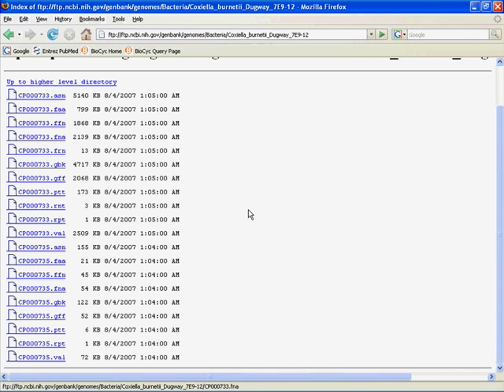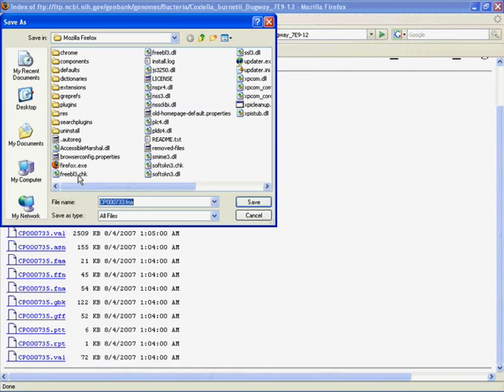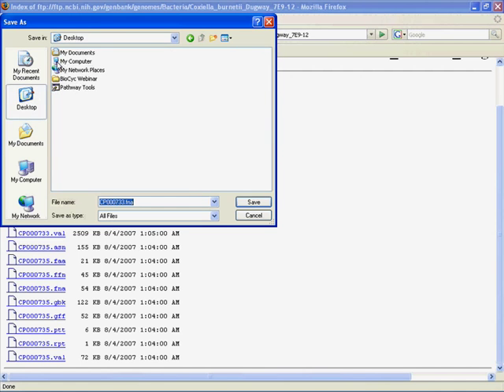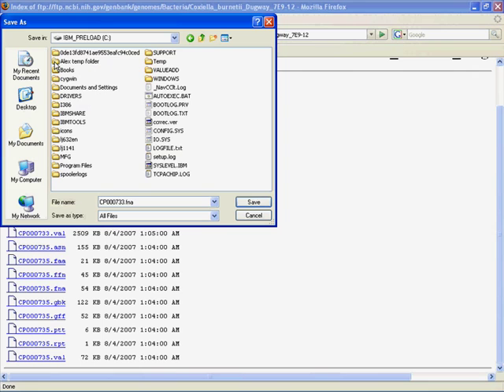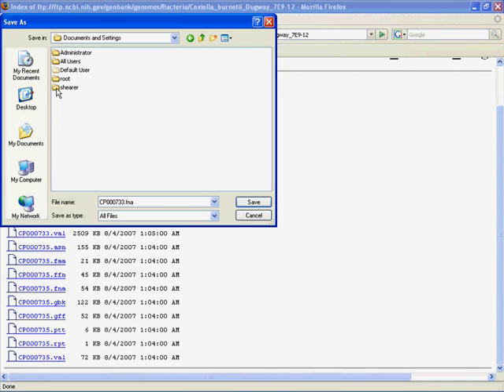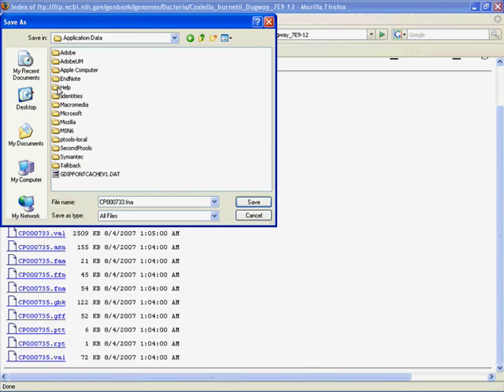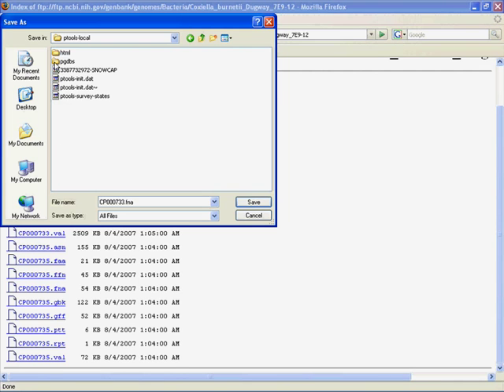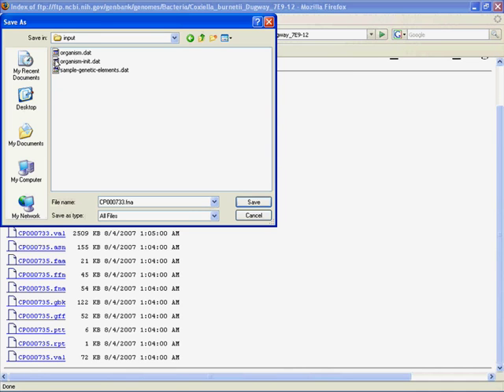Okay, so let's just start downloading and saving files. So we'll just start saving the files we need one by one into the appropriate directory. Starting with the FASTA file for the whole genome. So I'm just going to right click on that. Save link as. Okay. Back up to the desktop. For me. Computer. C. Documents and settings. Your username. And this is all on a Windows machine. This may work differently for you. You'll just want to look at where it told you it put the appropriate folder. And it told you that back on the Pathologic page that we started on. I'm going to application data. Ptools local. PGDBs for Pathway Genome Databases. User. CburnSeq. And 1.0. Input.